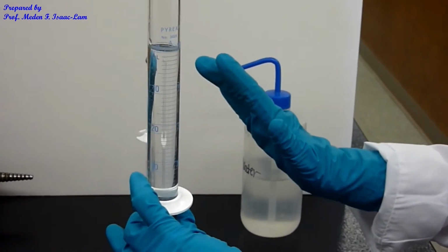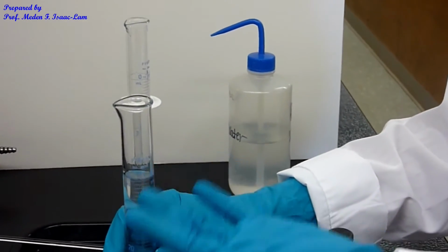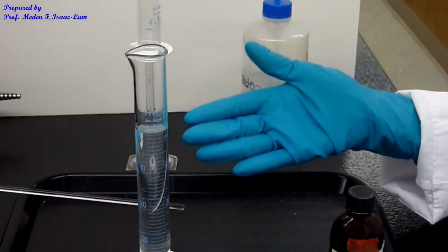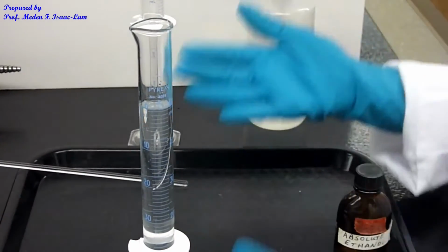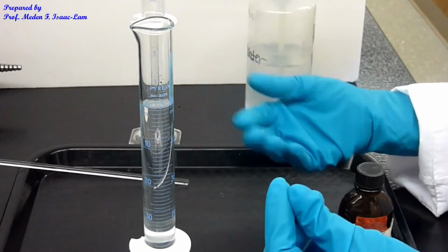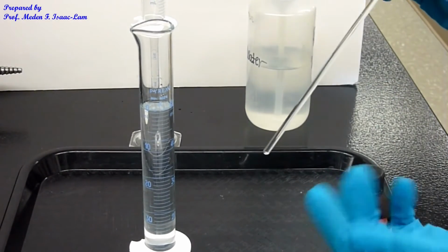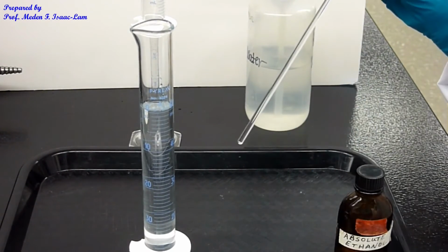It's soluble. So this is now your basic hand sanitizer that you can use. You can already use this as an antibacterial solution or antiviral solution, or as a disinfectant or as a sanitizer. Ethanol and water actually mix in all proportions.